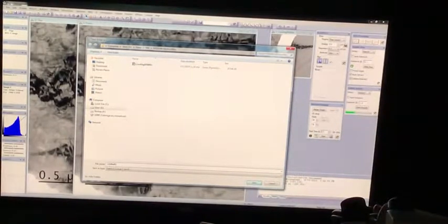Yeah, bright field 15,000. I'm not going to call it mid-mag or anything like that, because you can tell from the magnification. So I'm going to use the same nomenclature. I've got BF 6,000 times here, so I'm going to go BF, bright field, 15,000 times. And I'm going to go region of interest and save.